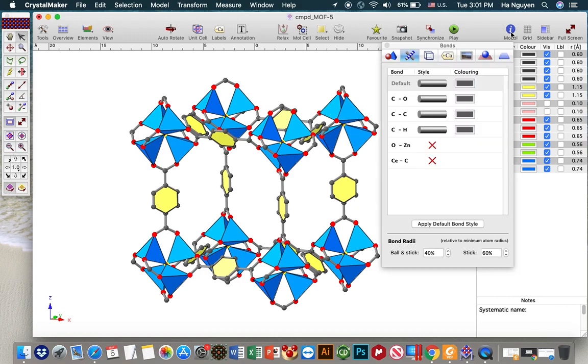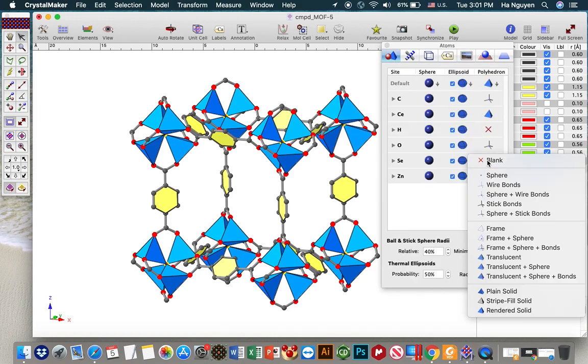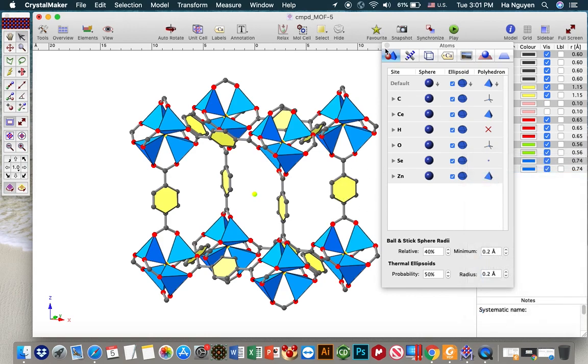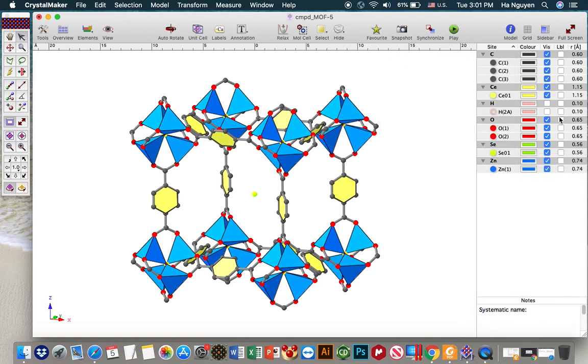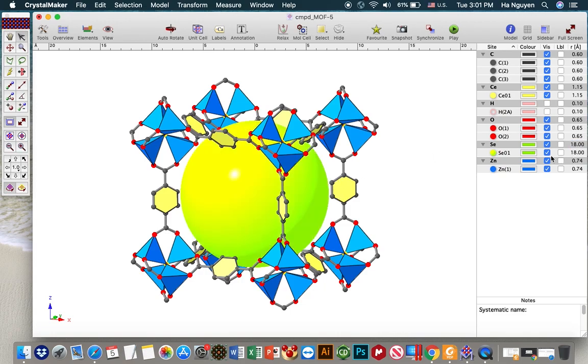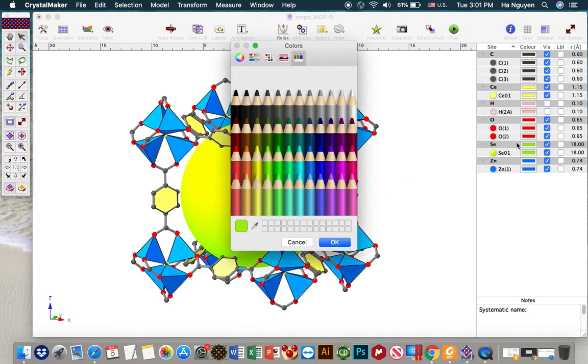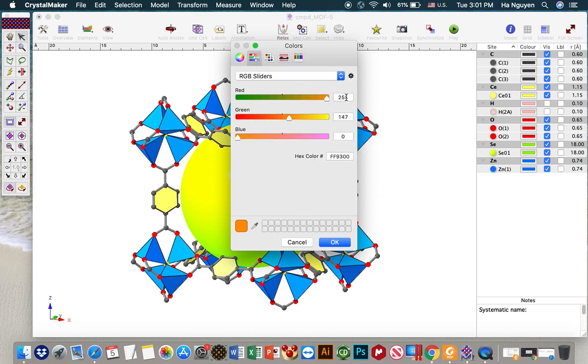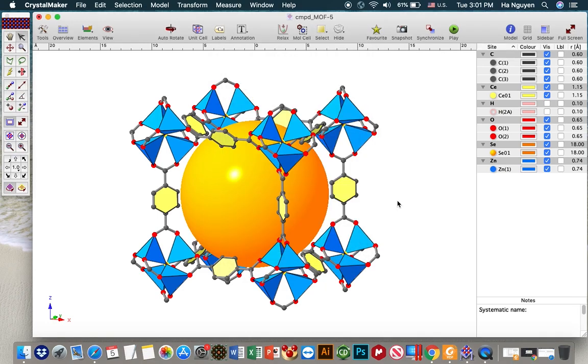And next one you have to do is you move to item style and then you choose style of selenium to be sphere. And you can change the size of the sphere to fit with the distance between the center to the phenyl ring from here to here. I put it around 18 for example. And then this one, make it orange. Perfect. Something like that.